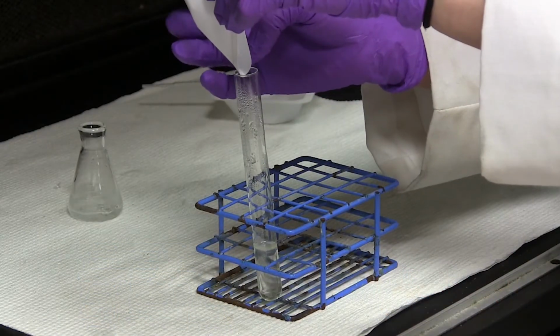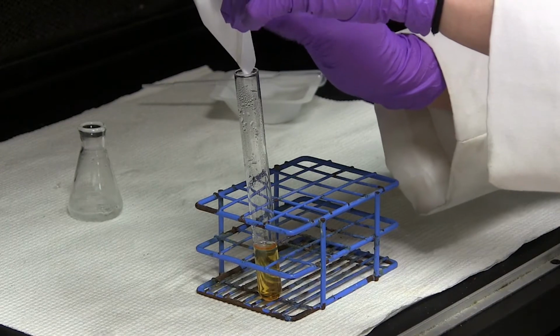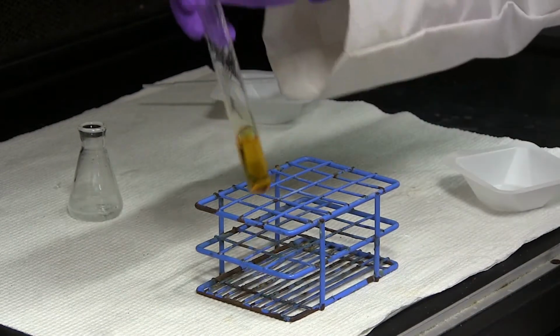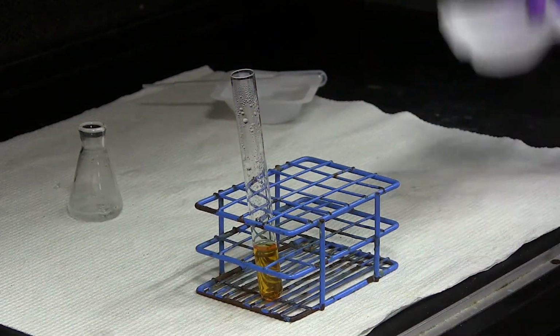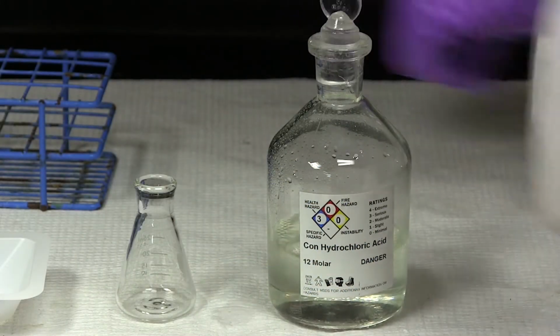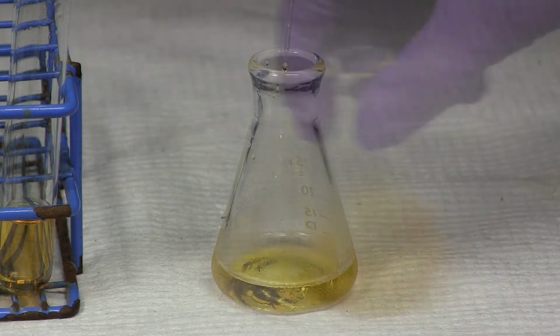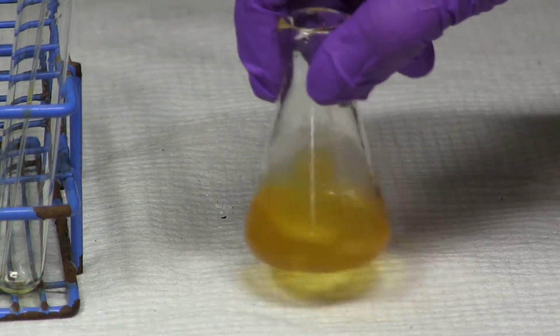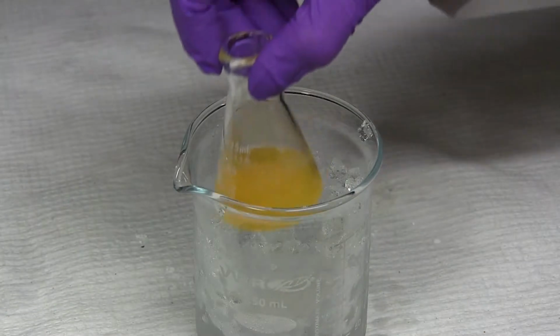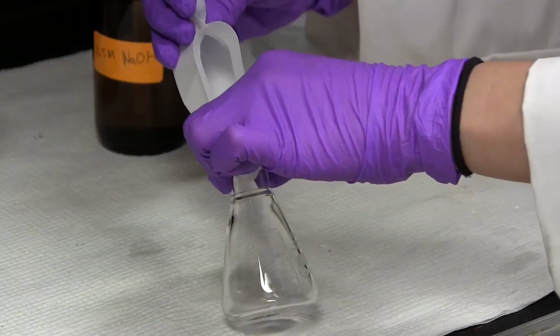Next, add 0.2 grams of sodium nitrite. Stir until dissolved. Add this solution dropwise to a 25 milliliter Erlenmeyer flask containing 0.55 milliliters of concentrated 12 molar hydrochloric acid and about 3 grams of ice. Swirl the solution frequently during the addition. Place the flask in an ice bath. A white precipitate of the diazonium salt should appear.